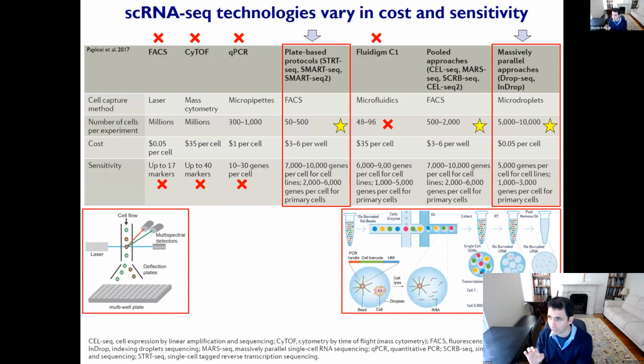So after doing a single RNA sequencing reaction, you can then go back and assign individual cell identities to every one of those RNA molecules. Okay. Who's with me on this one? That's an important concept. Awesome. So 64, 27, 550.